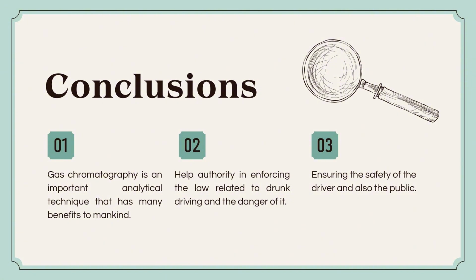So, as a conclusion, gas chromatography is an important analytical technique that has many benefits to mankind. It helps authorities in enforcing the law related to drunk driving and the danger of it, also ensuring the safety of the driver and the public.